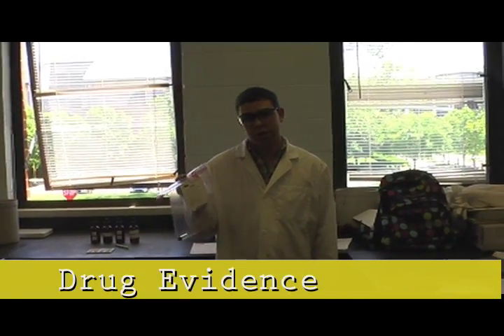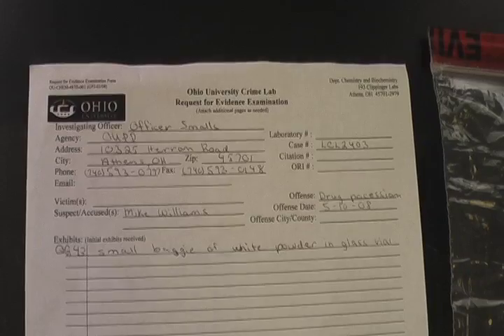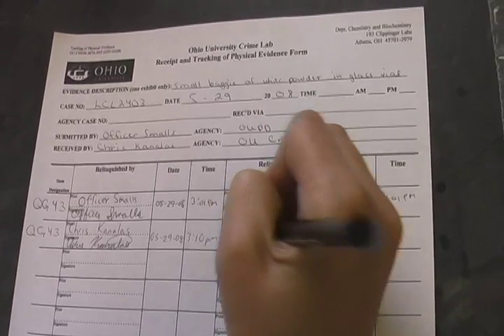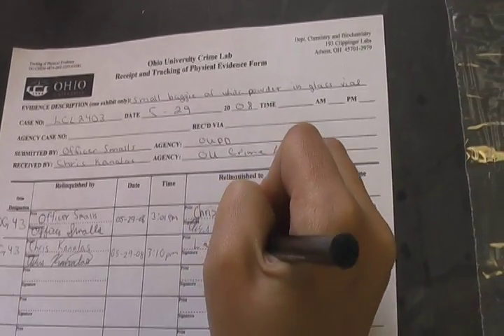We recently received an unknown drug sample from a drug raid. This sample must be identified to ensure the proper charges are brought upon the suspect. Whenever a sample is received into a crime lab, it must be logged in using a form such as this. Since I will be the one performing the chemical spot test on an unknown drug, it must first be relinquished to me.